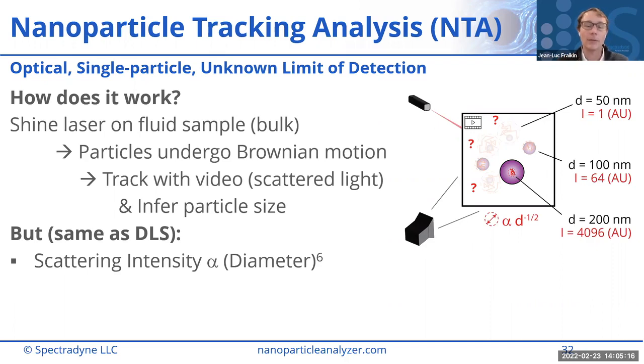However, we have many examples of oblong particles, especially weirdly shaped viruses. I know we call a couple of those out on our blog page, so if you have a chance to check those out, there is some discussion about how shape affects the measurement. Practically speaking, when people need to measure a very broad size range of particles, they start with the biggest cartridges, figure out what's in that size range, and then go to the smaller ones. The data automatically stitches together, so you can piece together the full size range that way. Does that answer your question?